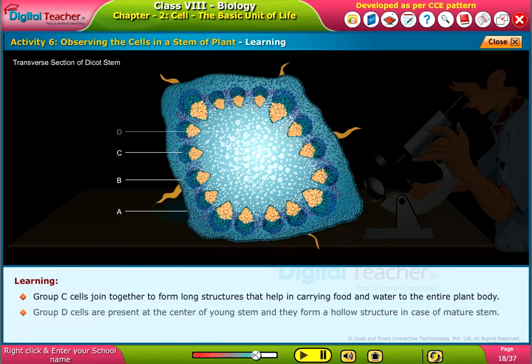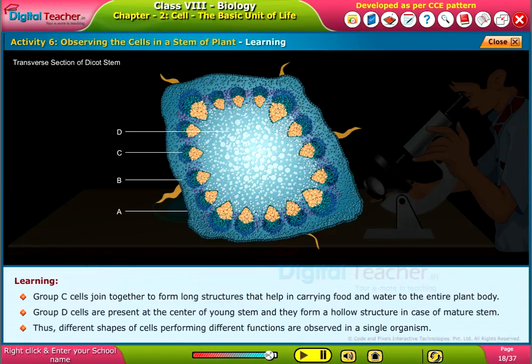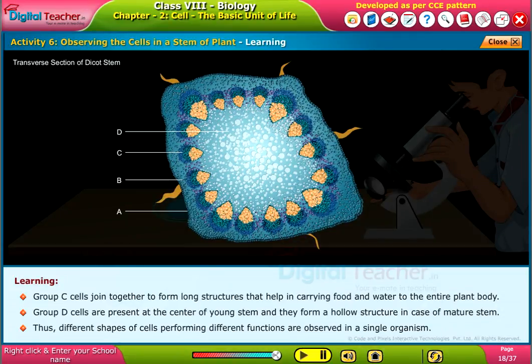Group D cells are present at the center of the young stem and they form a hollow structure in the case of a mature stem. Thus, different shapes of cells performing different functions are observed in a single organism.